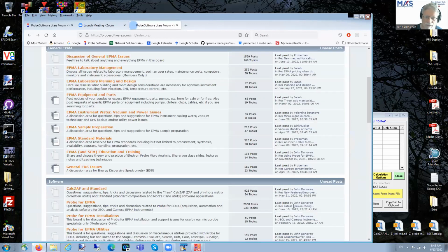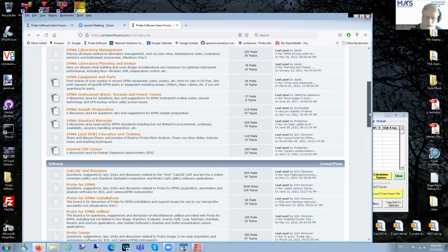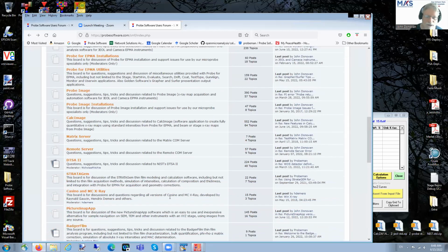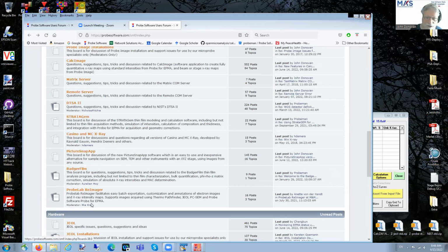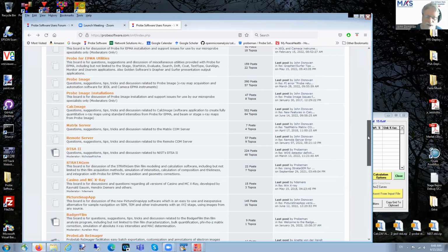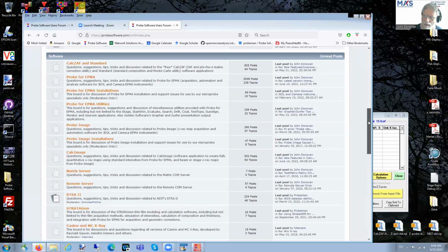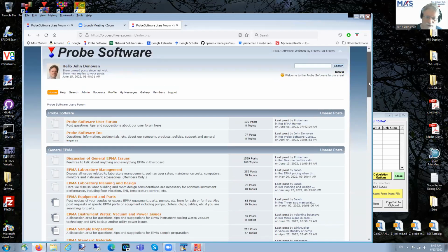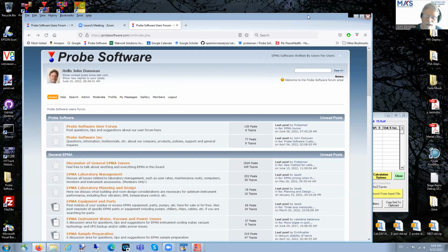But if you go back to the main page, I'll just point out for the other speakers, you might not know that their softwares are also on here. So for example, there is the Casino, MCXRay, Hendrix Demers is the moderator of that board. The Reimager, Mia Kraft, DTSA is right here, moderator Nicholas Ritchie. So several of the software packages are already on the forum, and you can ask questions there, read what people have asked before. I think it's a very valuable tool. So that's something to consider.